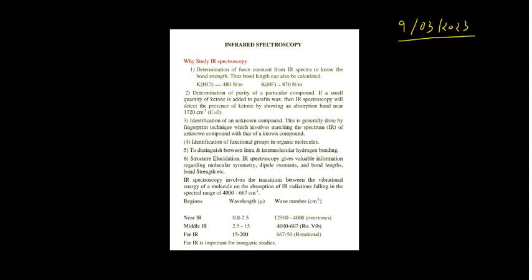Actually you can take a snapshot of this. So: determination of the force constant from the IR spectra to know the bond strength; thus bond length can also be calculated. Later on you will learn these things in much detail, but right now you can summarize these points point-wise. If you have the IR spectra, with its help you will get the IR stretching frequency, and once you know the stretching frequency, then by using Hooke's law you can determine the bond strength.